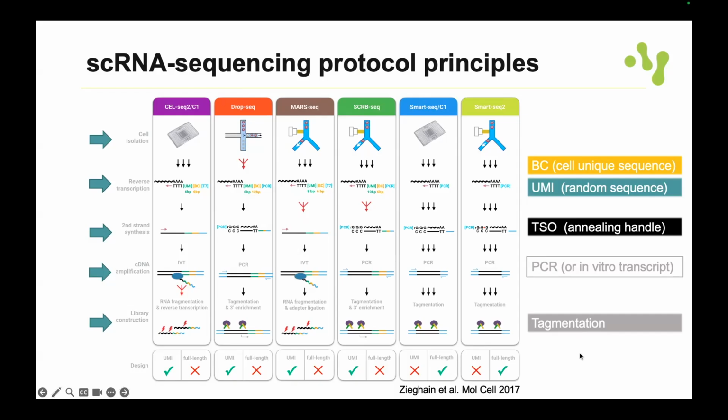I guess my only confusion was how many actual unique UMIs can we get with eight base pairs? But I'm sure there's a calculation, and then we can capture up to X amount of unique molecules. I can just add on to that: in the processing pipeline, we look at the combination of a unique UMI that binds to a specific gene after mapping the read also.